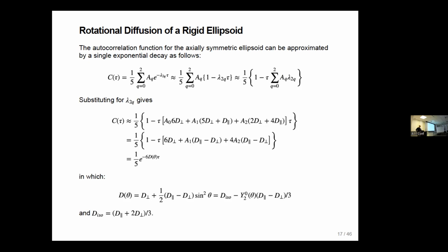The only real difference in the math is for the residual dipole coupling, you have a traceless tensor, which is a bit of a help. But if you can't align the molecule, then the relaxation anisotropy will work, and Nico Chandra has done that.